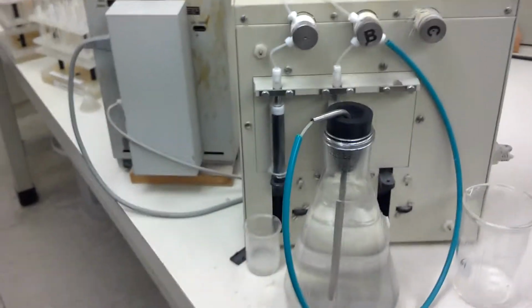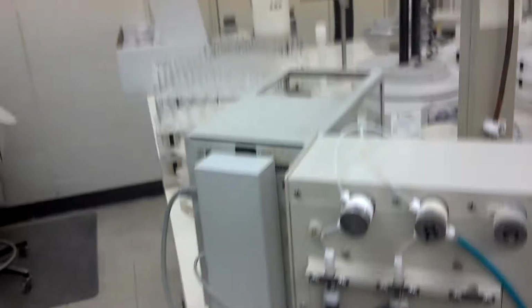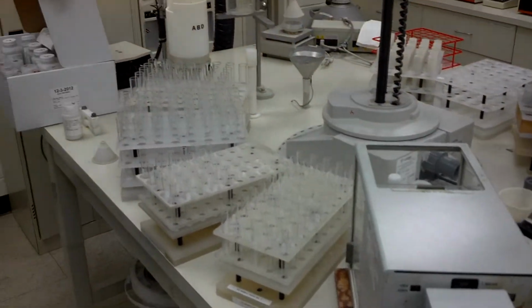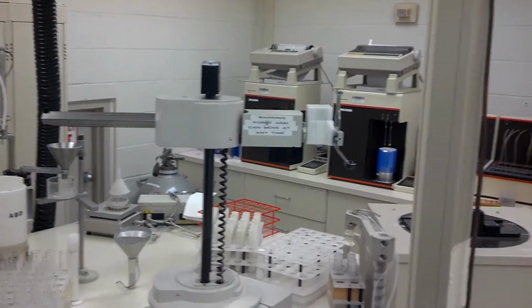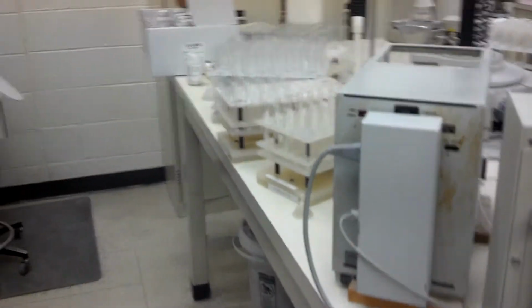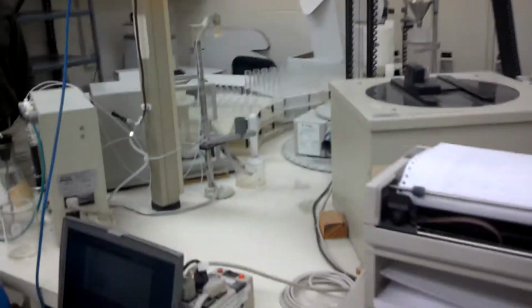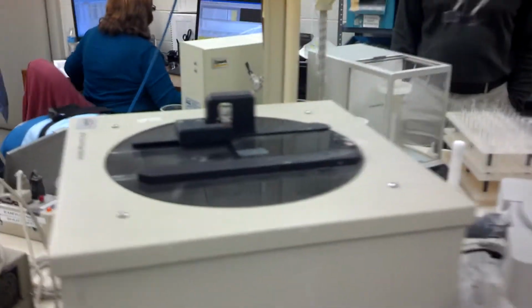In fact, I'll show you a couple concepts. You know, I haven't thought this through, and I want our engineering folks to kind of think it through a little bit. Sure. But this will help them get an idea of the layout. Sure. I mean, if it was up to me, I didn't know if this platform had to be this large. I don't know that it needs to be either. It just depends upon... I think it's that large probably because of the number of samples that you need to handle, and you've got all the labware. You have a big centrifuge. You have a big robot, right?